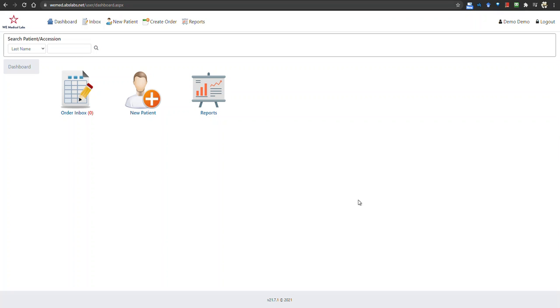Hello, in this video I'll be showing you how to create a new order on a patient. First you'll go to this area and look for the patient. This assumes that you already have a patient record in the system.